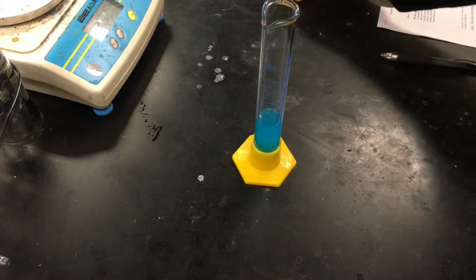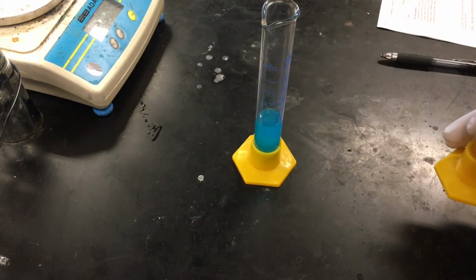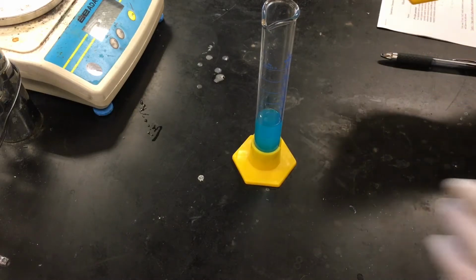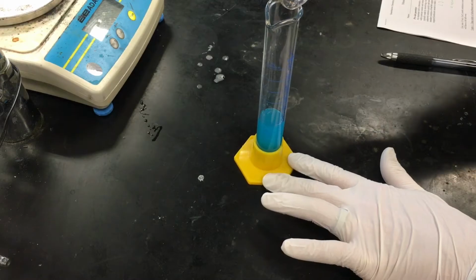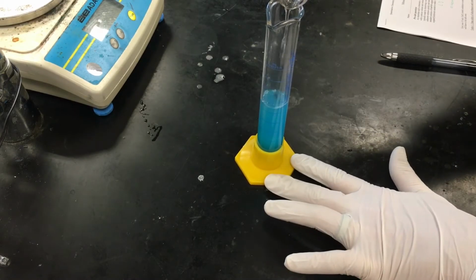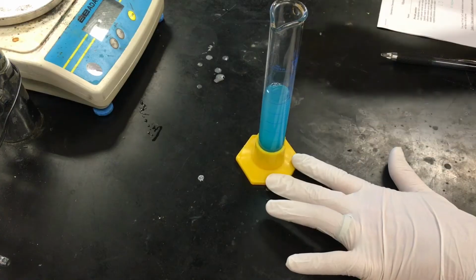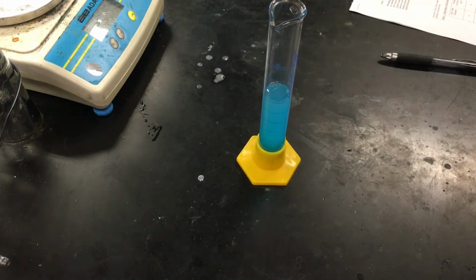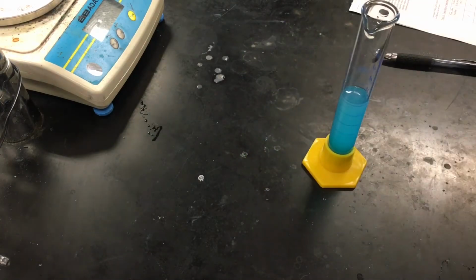And now what we're going to do is add more water until the volume of the solution totals 35. There we go. So now we have 35 milliliters of the copper chloride solution.